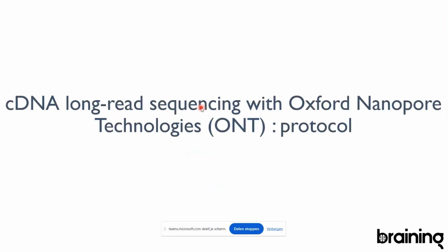Good. So then, if there are no questions, we can move to the last part, and that would be the protocol. So I will outline very quickly the conceptual steps of the protocol. So what I do, for example, is I want to look at splicing, and so I will use copy DNA with a reverse transcriptase with Oxford Nanopore technology, so with Nanopore. And so I will specifically go with you through a protocol where we can do this.